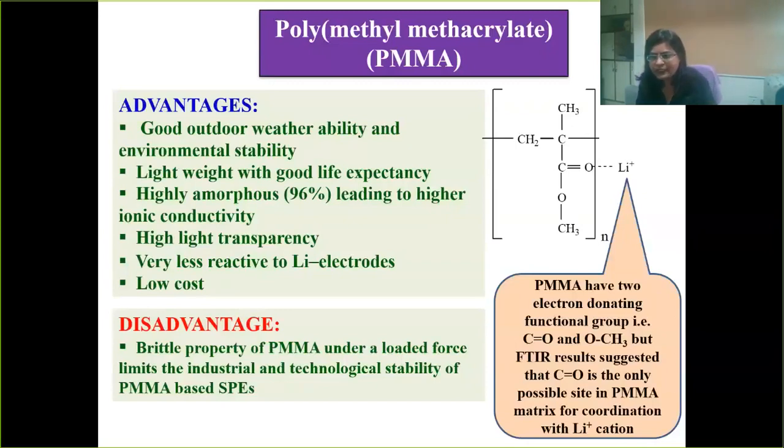On the other hand, we require a flexible material, so it is a drawback of PMMA. Under a certain loaded force, it limits the industrial and technological stability of only PMMA based SPE. In polymethyl methacrylate, there are two possible electron donating functional groups, but the FTIR results suggest that the carbonyl group, C double bond O, is the only possible site from which the cation can coordinate. Next, sir.